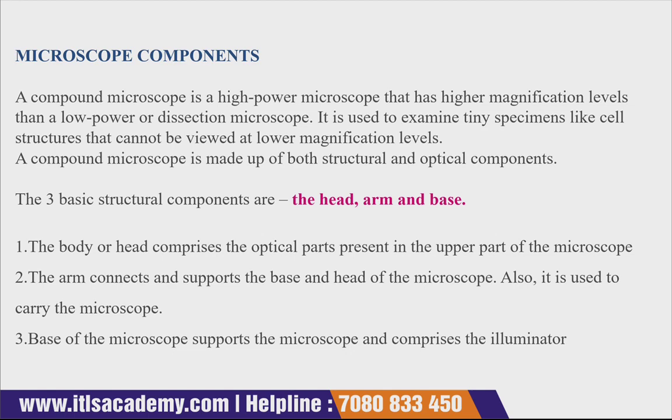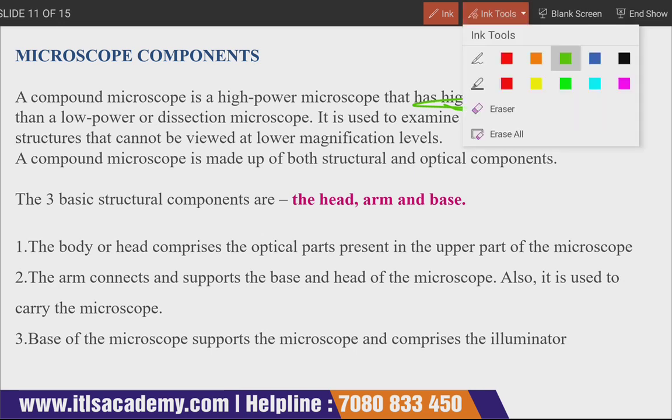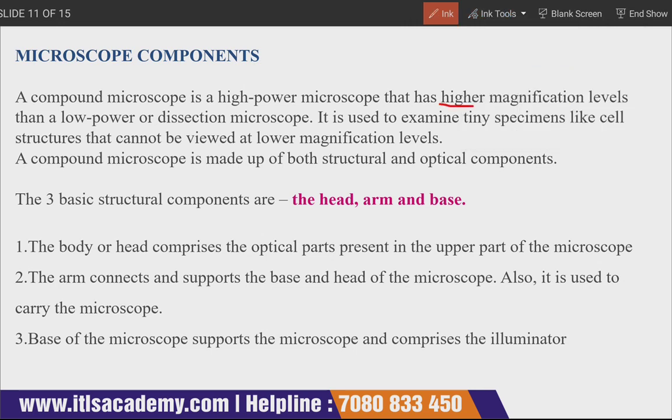Whenever something has, you know, students, a higher magnification, this term simply means that the image you are getting is of higher magnification, meaning higher clarity and quality, right?